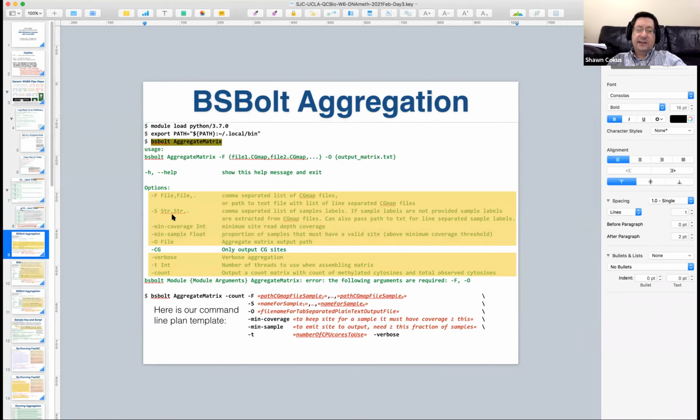You have to give it the sample names to use as the column labels for those different files, because the file names usually are not very nice. Right now we've only got the SRX accession numbers in there. We actually need to know for the analysis which one is the neural progenitors and which one is the mesenchyme, and so on. So we need sample names that make sense and are reasonable to use. So we take the parameter for those.